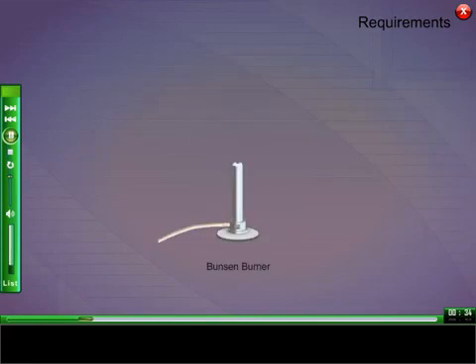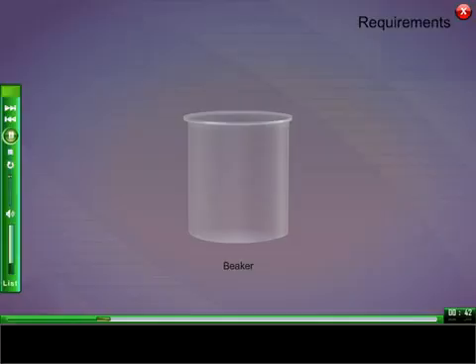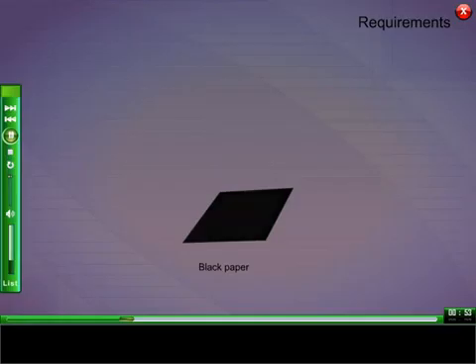Bunsen burner, forceps, beaker, water, dropper, black paper.